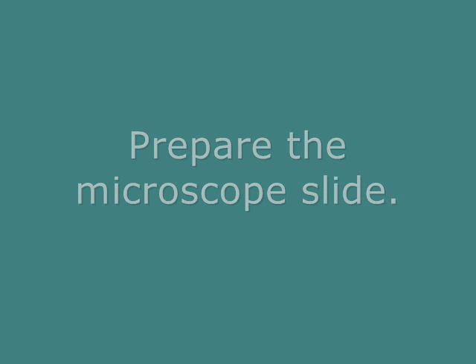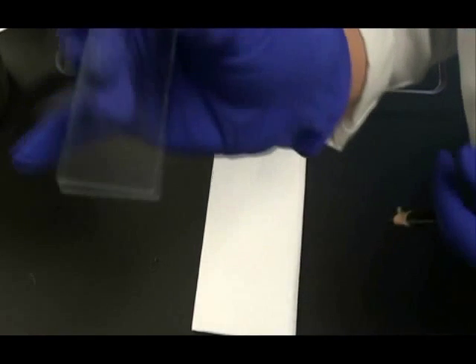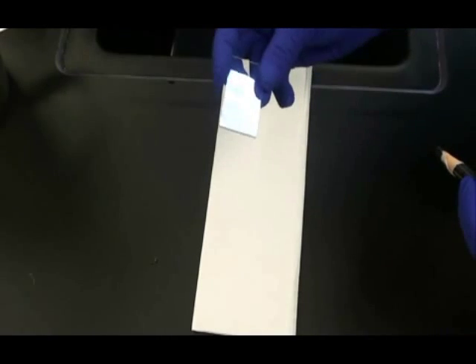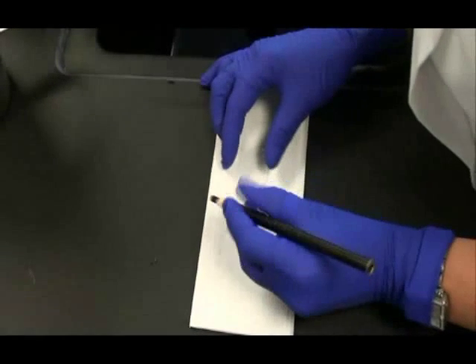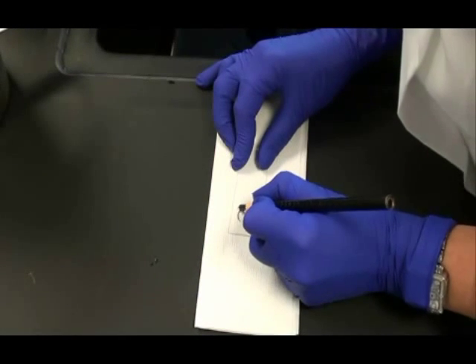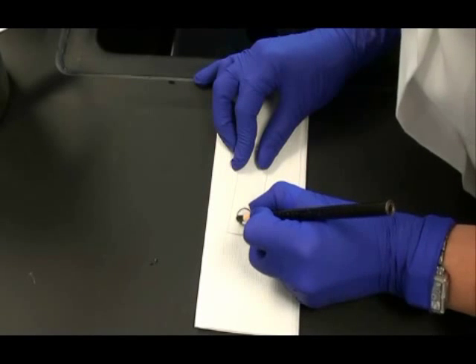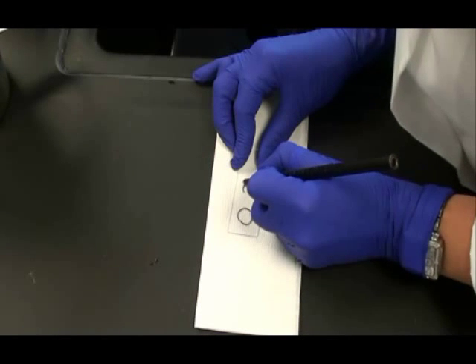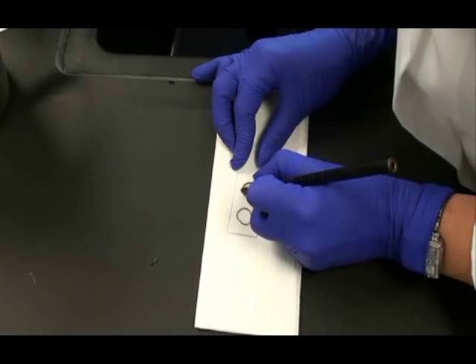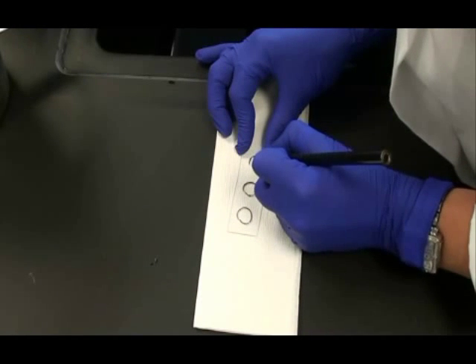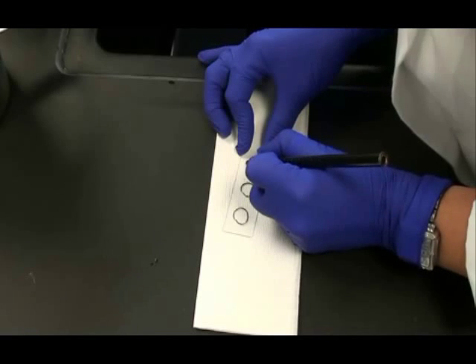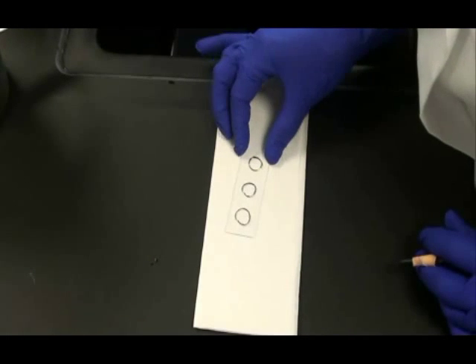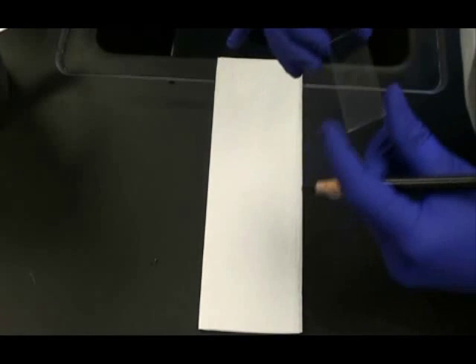Now we need to prepare our slide for endospore staining. We're going to make a bacterial smear. I start out with a microscope slide that I'm going to make three circles on with a wax pencil. The circle on the left will have my endospore positive sample. The circle on the right will have my endospore negative sample. And the circle in the center will have my unknown.